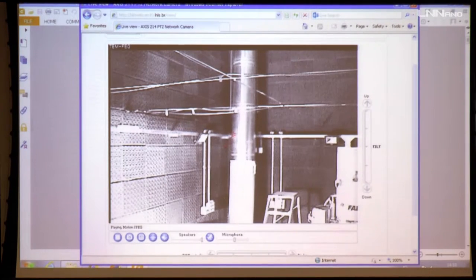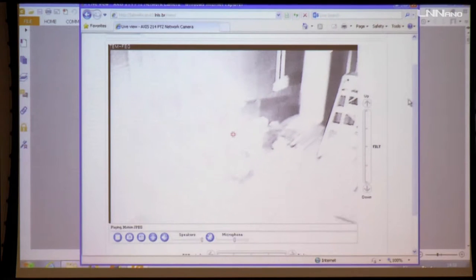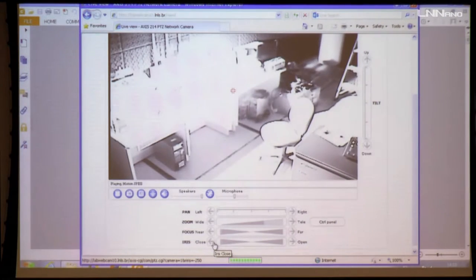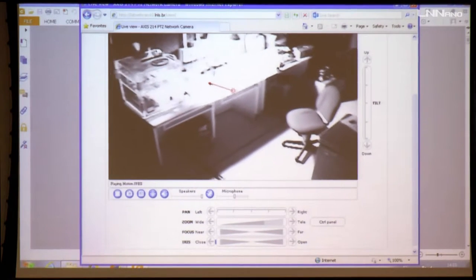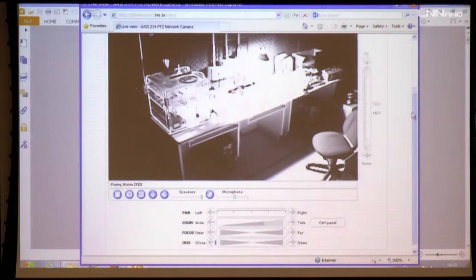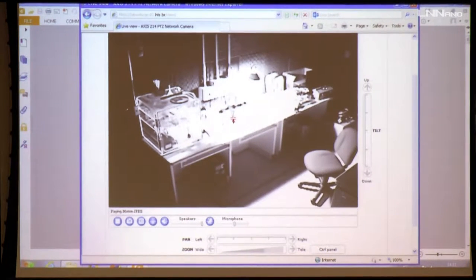One more thing I want to show you is where we place the TEM samples. Normally we place all the TEM samples and the tools we want to use for changing the TEM samples in a closed cabinet. If something is exposed to the air and falls onto these O-rings, and the O-rings go into the TEM column, the vacuum can be contaminated. So everything is preserved properly and cleanly, and we expect the users to do the same. When they finish their sessions, we ask all users to leave the space really clean and tidy.